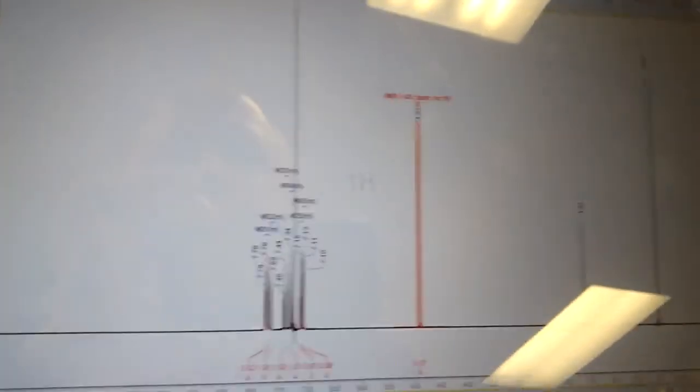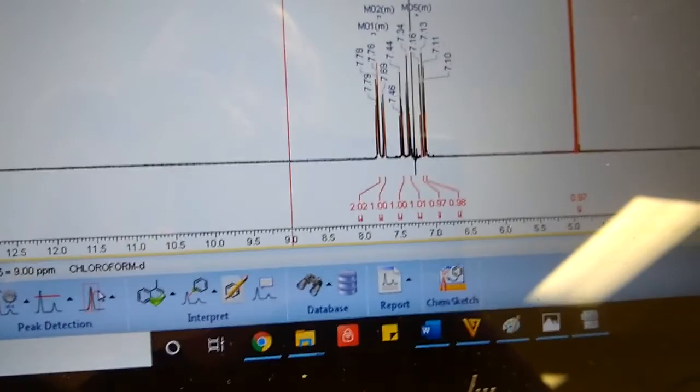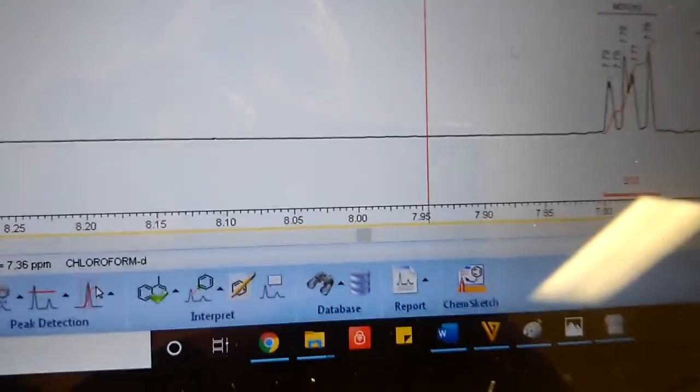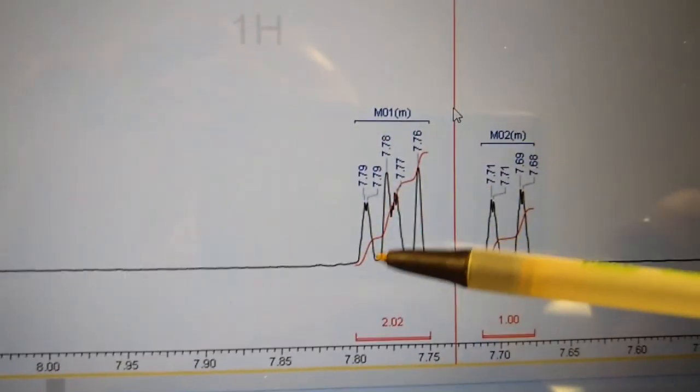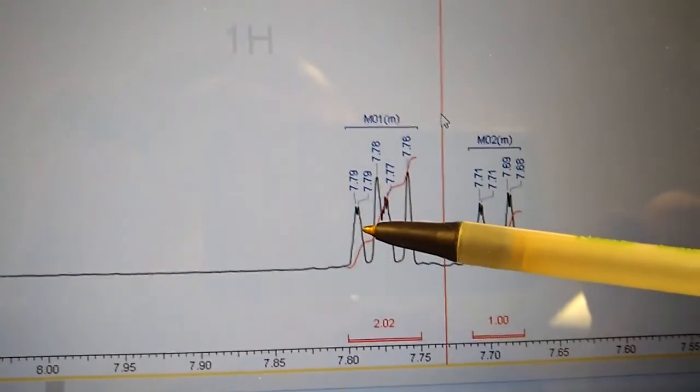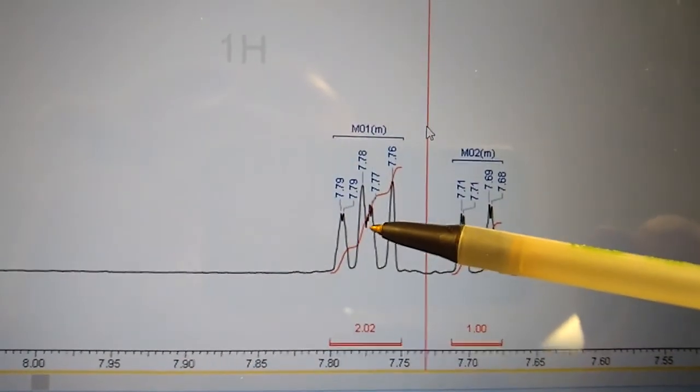Your OH signal would be that's just a singlet. And this signal right here, it looks like it's probably two doublets that are overlapping, so we can just call that a multiplet when it's not totally clear to you.